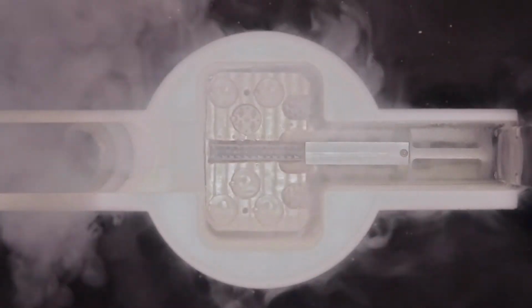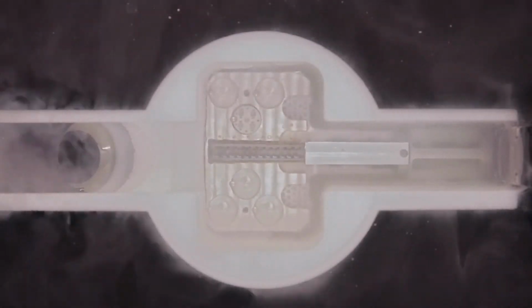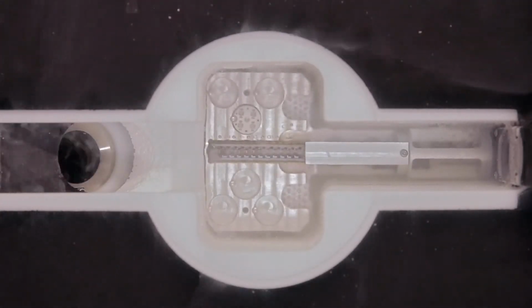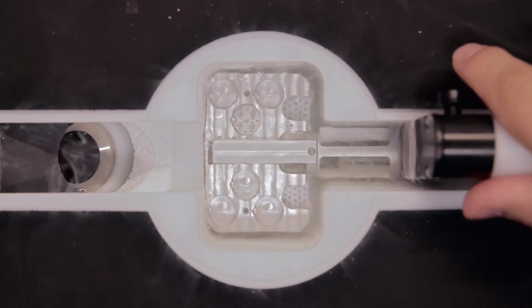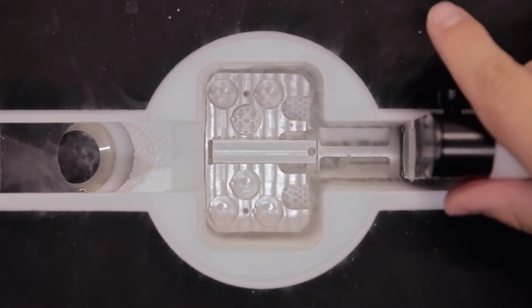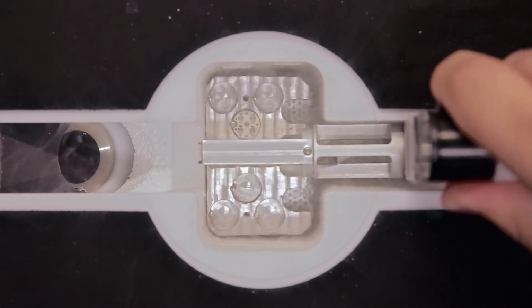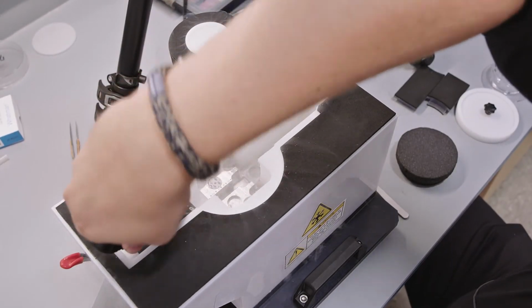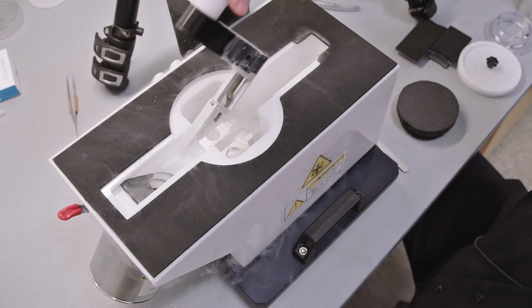And you may spill here. The more nitrogen vapor you spill, the cleaner you will work, because this will expel all the water vapor. And we then take the handle, slide it over the cassette, grab the cassette by pushing the pin, and then going into the capsule, releasing the pin and taking the handle out.